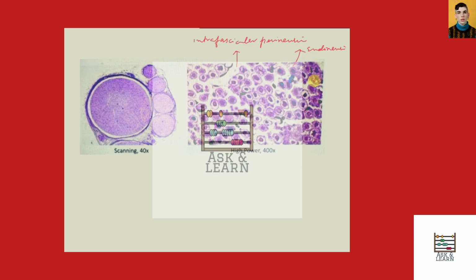And these individuals here, they represent the nerve fibers.